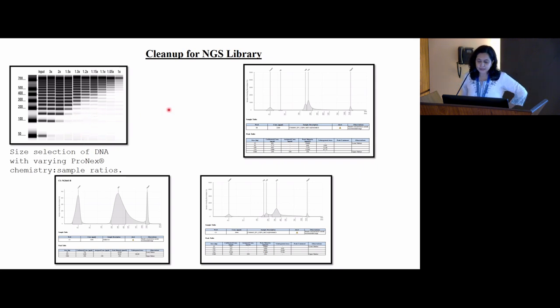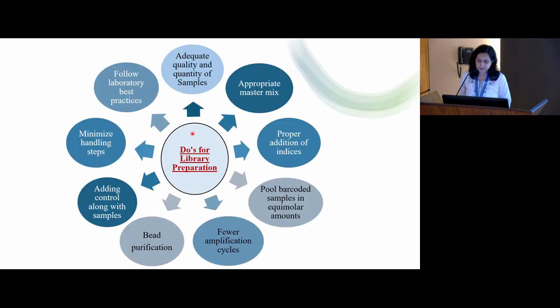Here you can see these peaks showing adapter contamination. This should not be there, because if it is there, it will give you downstream application errors.